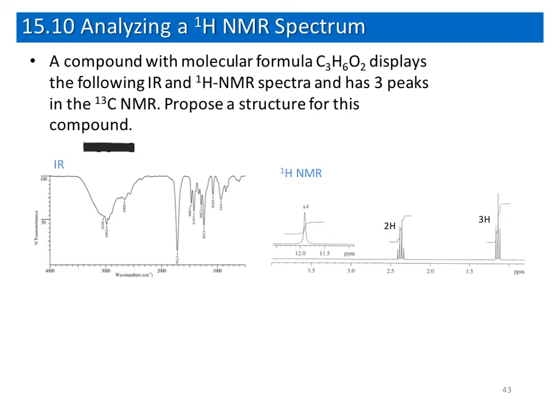In a lot of NMR spectra, if we see a peak all the way at higher ppm, and there is nothing after, for example, 2.5 to 11.5 ppm, this part of the spectrum is cut out, so we can see these signals more clearly. But that subsection is part of the spectrum. So we have a peak at 12 ppm for this structure. Now let's work on this problem.